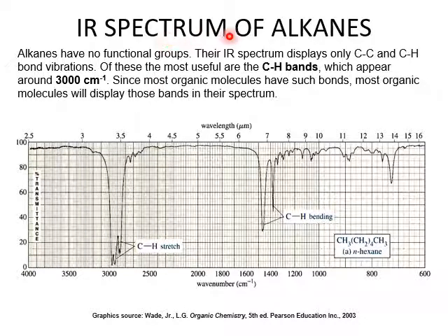In the IR spectrum of alkanes, you sometimes can have two signals. For example, for hexane, you will get some CH bending. So this H, imagine it going like this, like a pendulum. And you have stretching, which can be like this. For alkanes, it will appear mostly at 3000, around here. This will be the stronger bands. These will be the weaker ones.